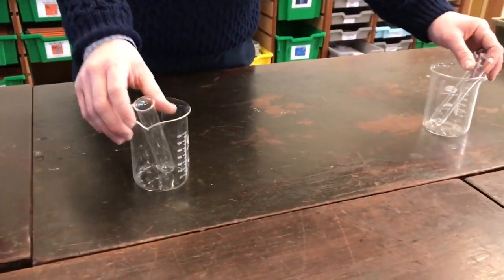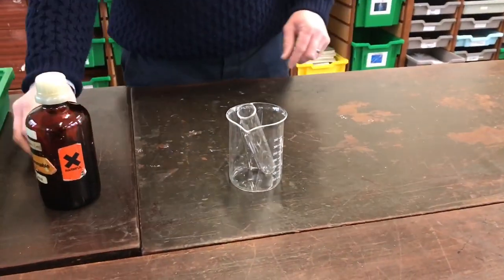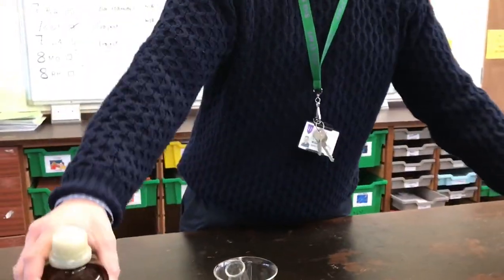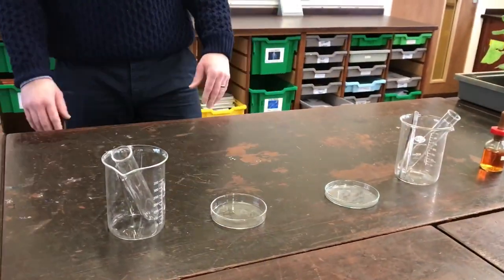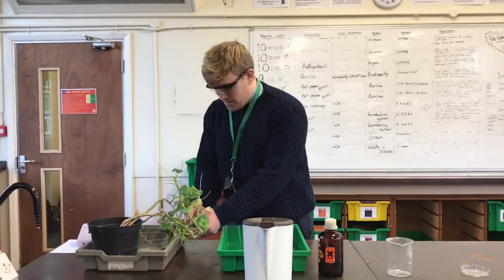You will need two beakers, two boiling tubes, two sets of tweezers. We have our iodine, we have our ethanol, and we have a couple of petri dishes.